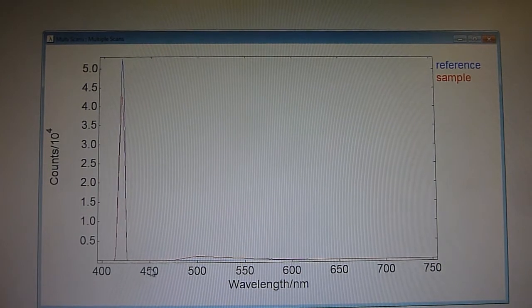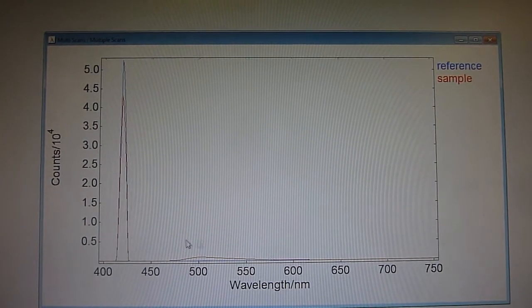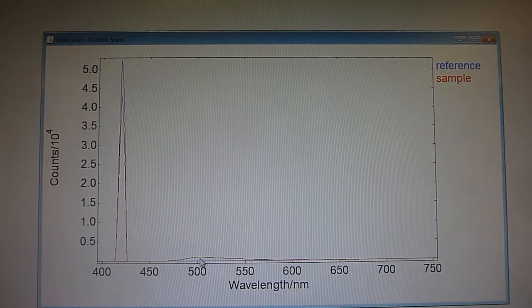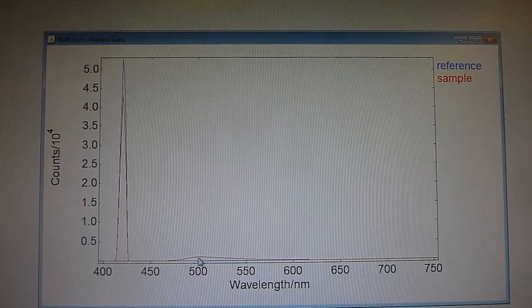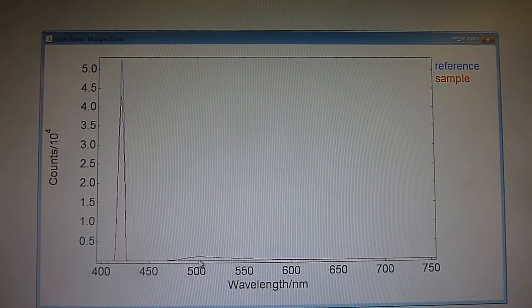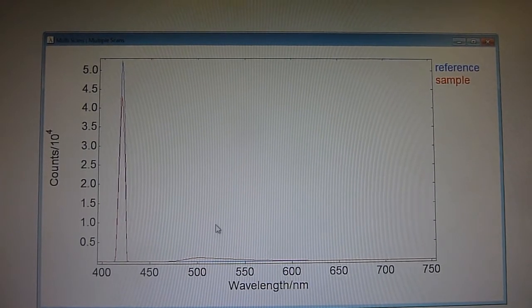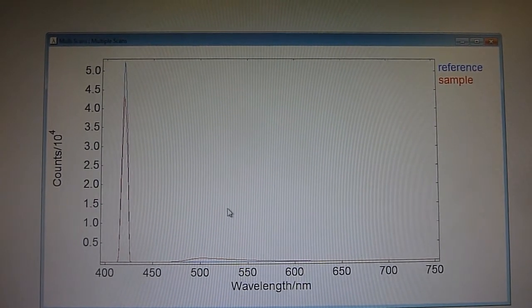Whereas in the region here between 450 and 650 we're looking at where essentially the sample is fluorescent. The difference between these two peaks here represents the emitted light, and the ratio between those two is essentially the quantum yield.